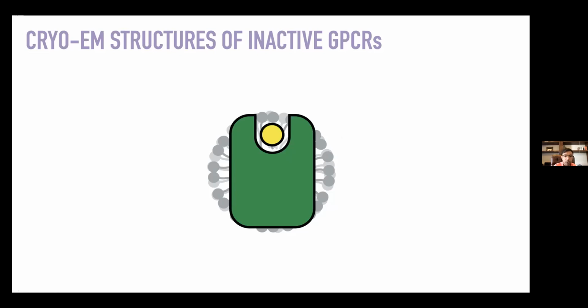So we've also been pondering and working on using our single domain antibodies to essentially serve as fiducials for inactive state structures of G protein coupled receptors. And this is not a new idea. People proposed this quite some time ago, and Yifan Chang, our main collaborator in all this work, proposed that using antibody fragments or FAB fragments for small membrane proteins may function as far back as a decade or so ago.